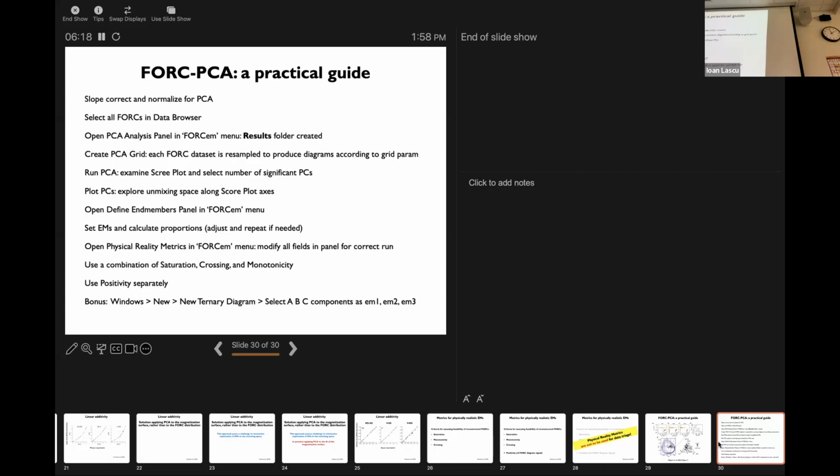For example, you have multiple vortices, and this one can cause this fork, and all 3 forks look very similar, but they're all caused by different things. Yeah, if they're really the same, then you can't separate them. But if they differ and you have enough of them and a mix of them to cover the mixing space, then maybe you'll be able to.